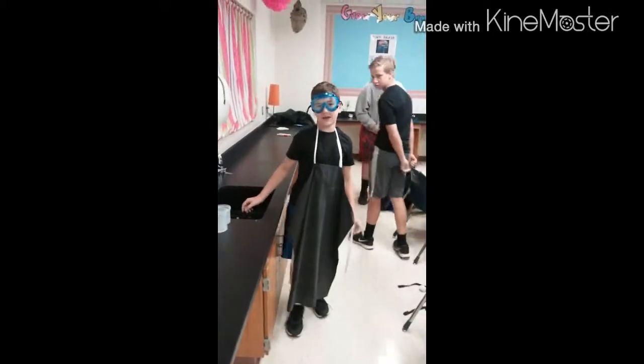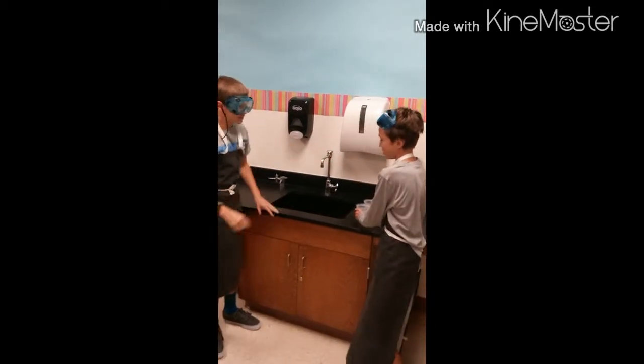No more play in the science room. First slide before it goes down the drain.